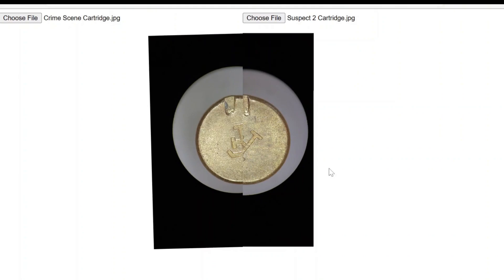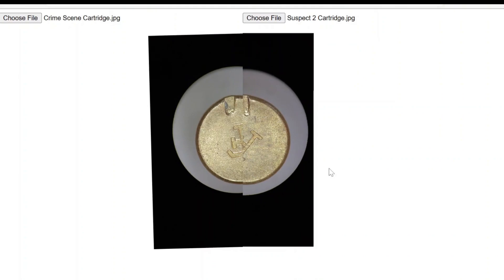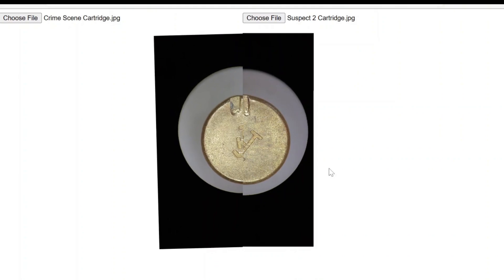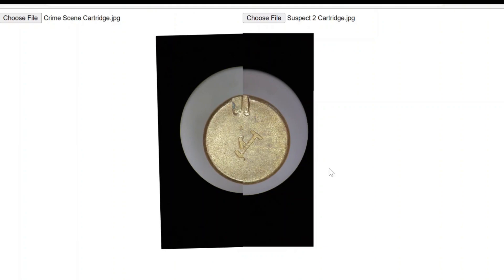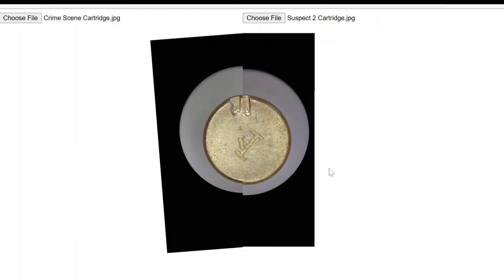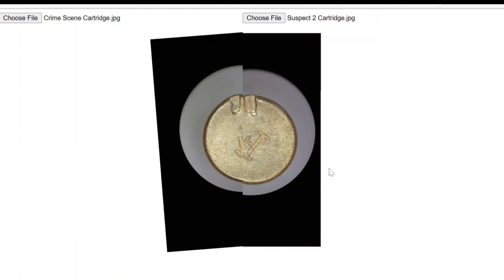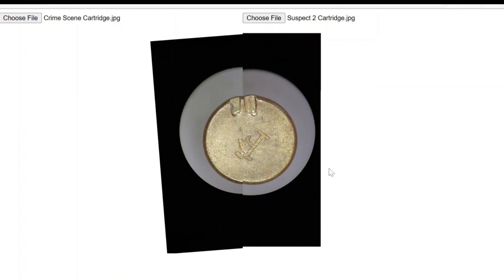Try to get them to be the same size. And then I'm going to try to line them up. It looks like I got to rotate this one a little bit, maybe. And I want to see, maybe right now you can tell, hey, those are a little bit different, but if they were similar, you'd want to overlap them some more.